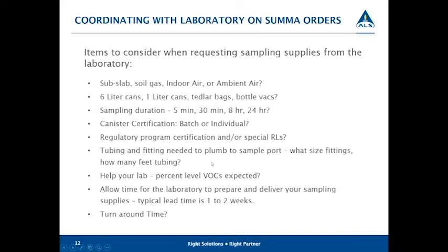What tubing and fitting are needed to plumb to your sample port? What size fittings do you need? How many feet of tubing? Help your lab.